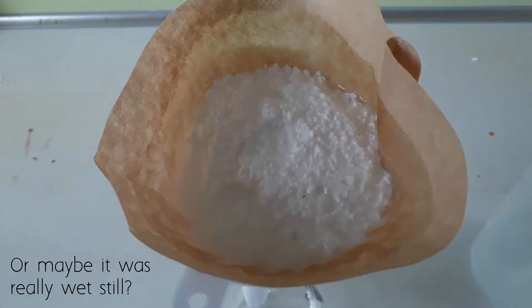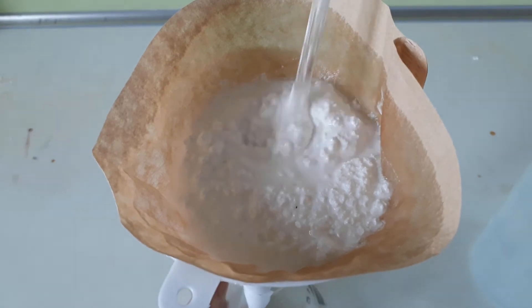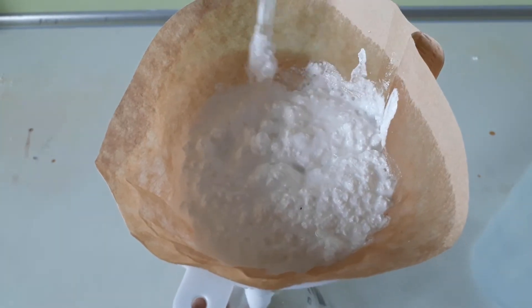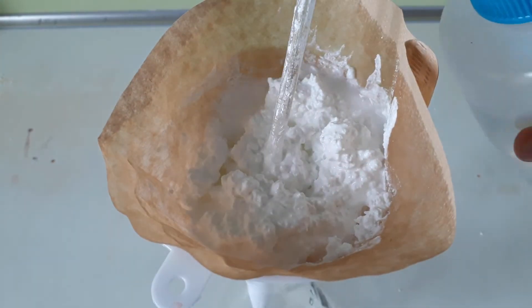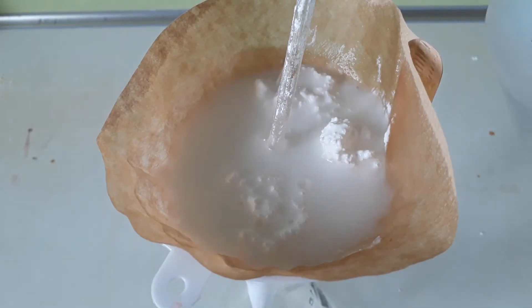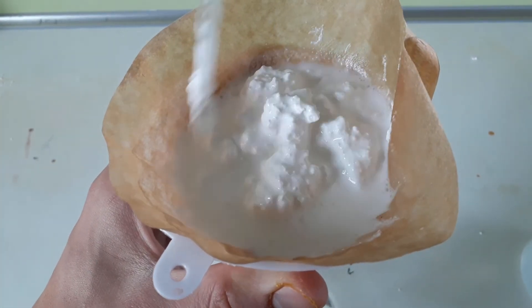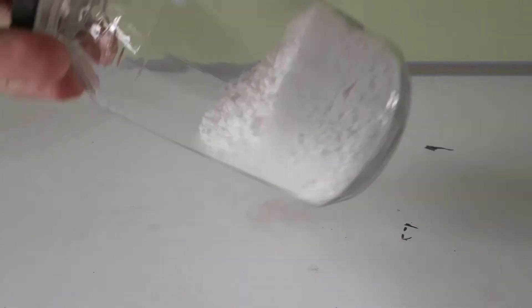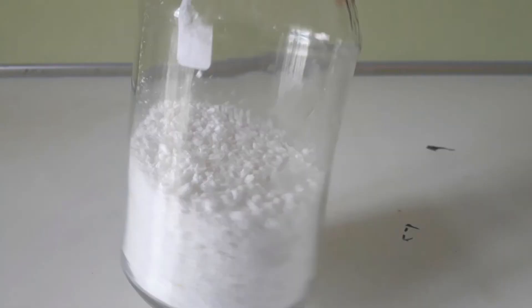So I decided to do another washing step and another drying step. But it turns out, as you'll see later, my product wasn't actually dry whatsoever. In the end, I gave up at a 110% yield and just continued with the next step.